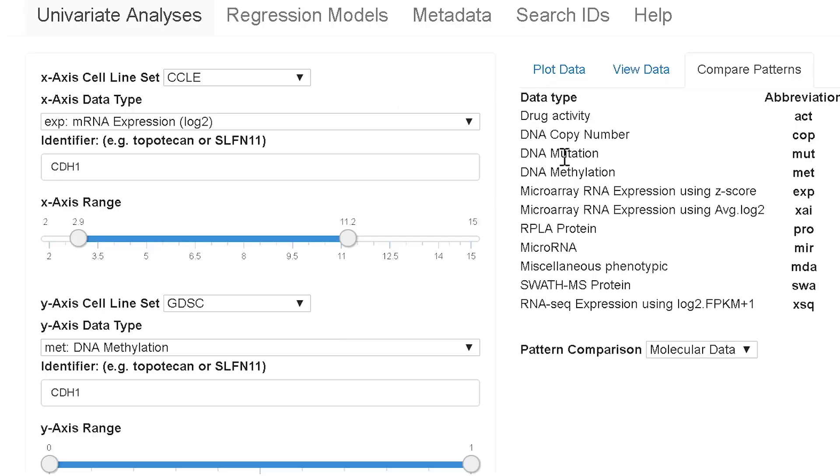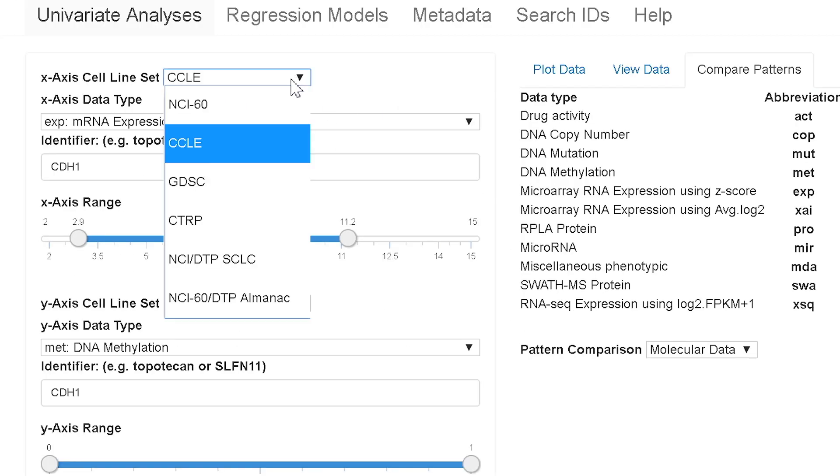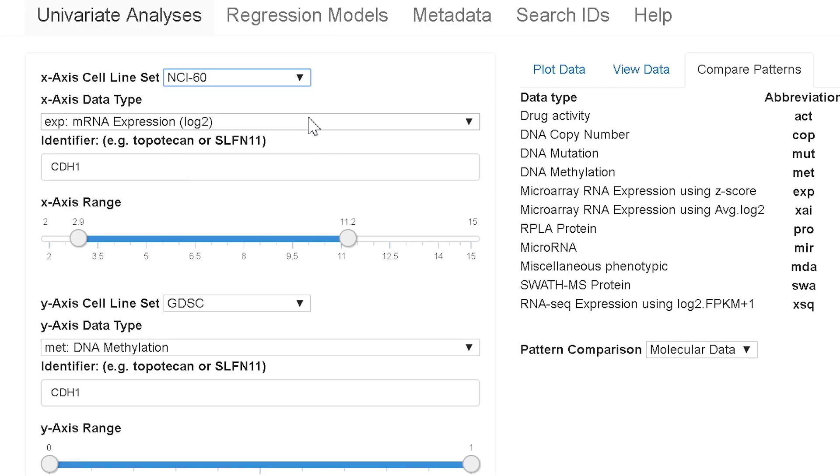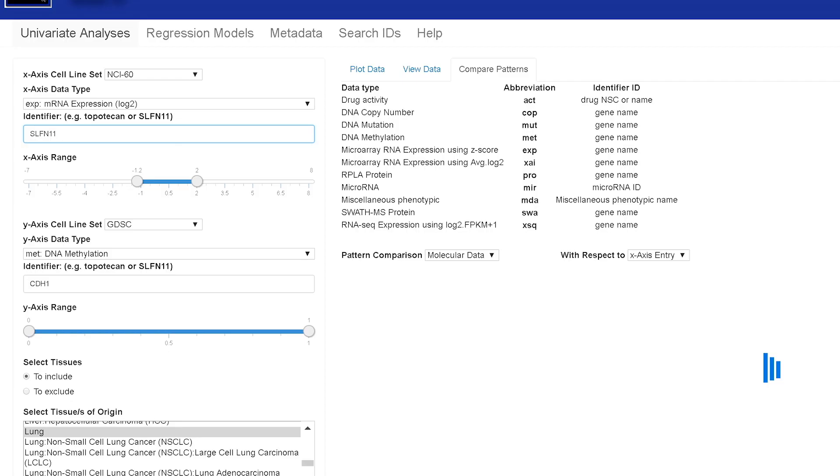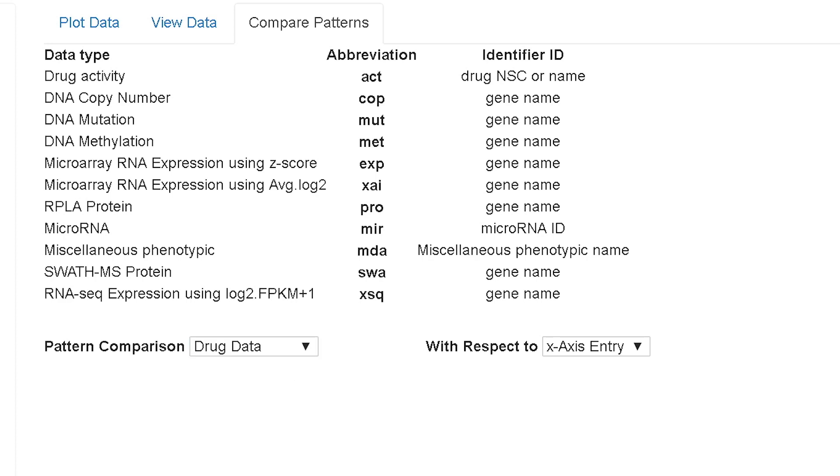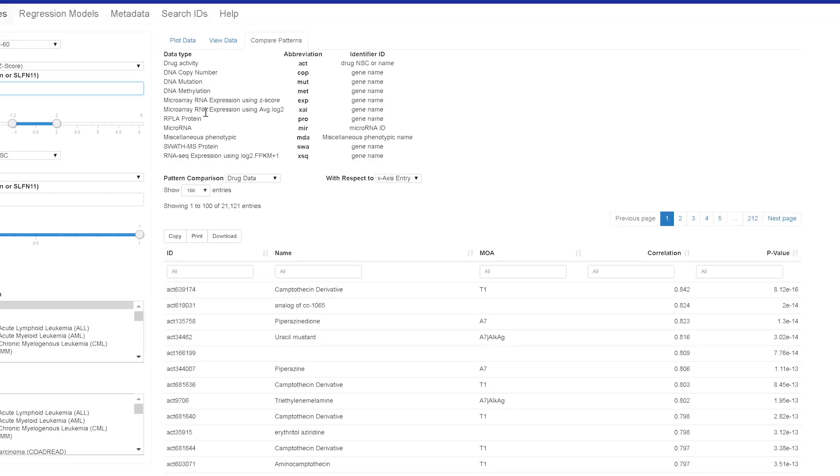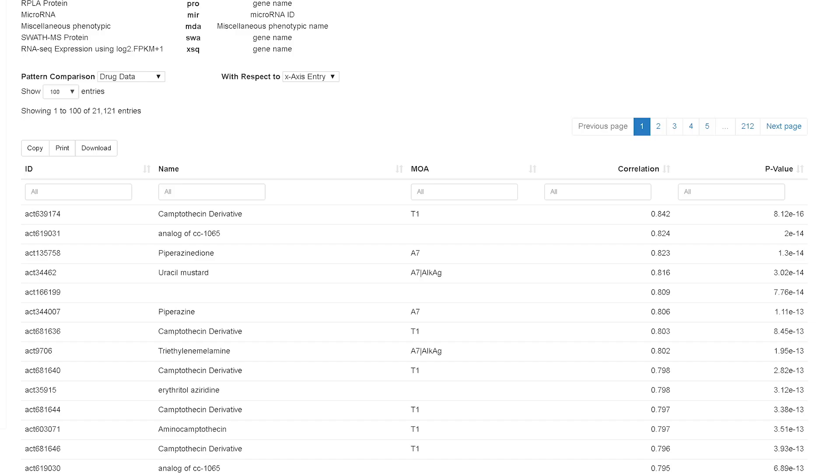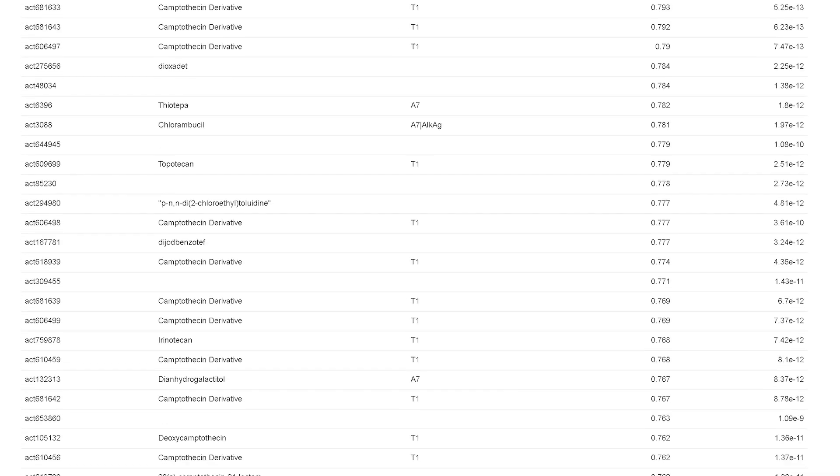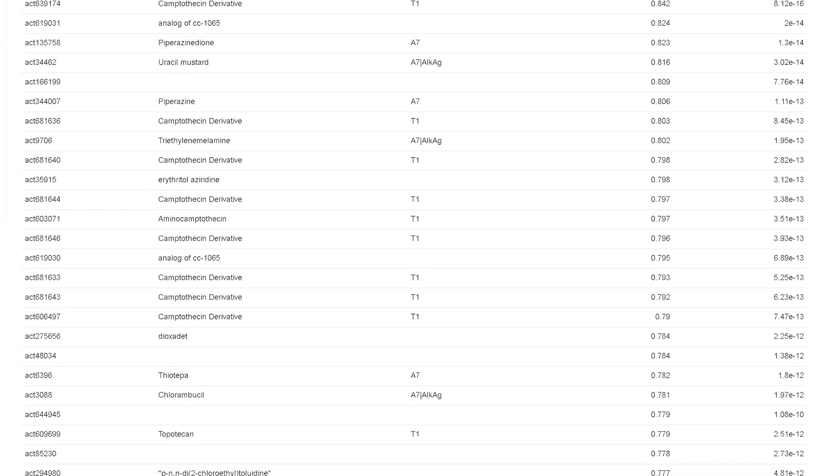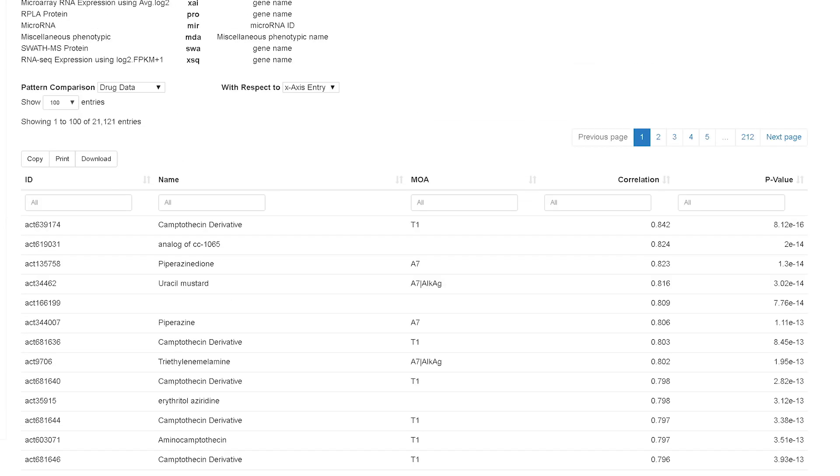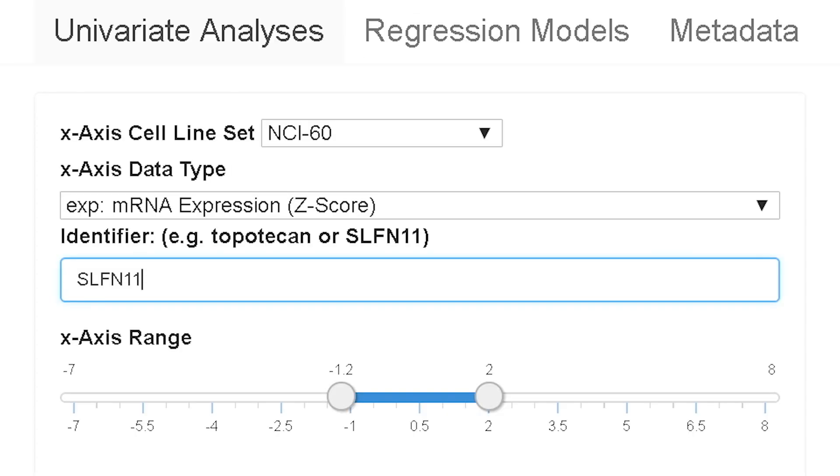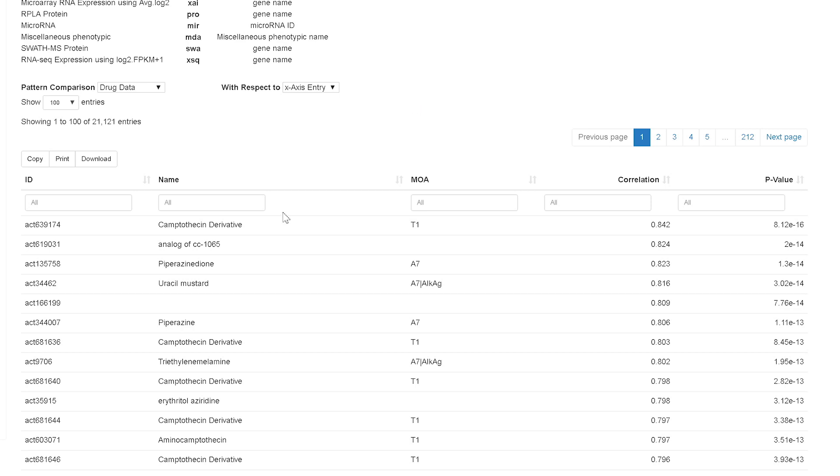Compare patterns, we'll switch back to NCI-60. And so now what's brought up is the activity levels of multiple drugs. You'll see here there's abbreviations, T1 stands for topoisomerase 1 inhibitors, A7 is an alkylating agent. And if you scroll down you'll find many of these kinds of drugs. Further down you'll find some T2s which are topoisomerase 2 inhibitors. These are related causally to this gene which affects DNA damage drugs and their responses. And these are all DNA damaging drugs.